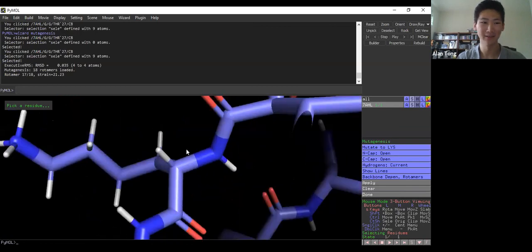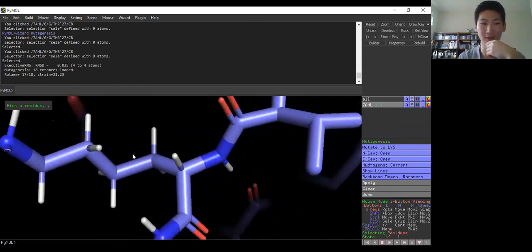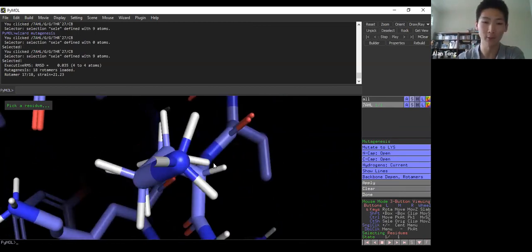So you see how we've changed the amino acid to lysine, and you can actually predict, using this program, if you mutate this amino acid here, what might that look like? What kind of bonds will it make? How might it interact with other residues nearby? 1QOH, yeah, sure. I'll look at that soon, all right? So you can mutate things as well. So you can look at these different structures, and you can also zoom in and out, right, via this axis of viewing.